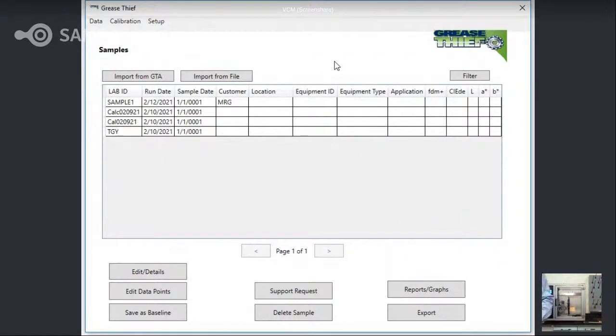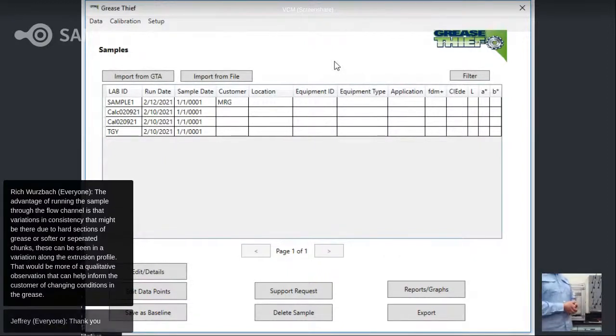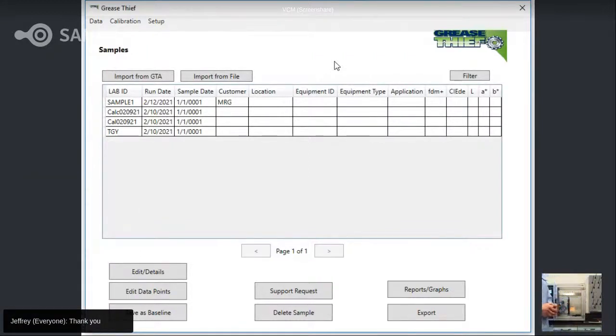All right. I know the other thing we had to talk about, one thing that we'll get out of this, and we mentioned it slightly, is that our die extrusion is measuring the dynamic flow properties or consistency changes that have an influence on the grease's properties when it would be changing, whether it be hardening, softening, leaking oil, what have you. So the die extrusion provides value to be able to quickly get that reading, be able to know you're changing your grease, and then if you need to, you would be able to take maintenance action, whether it be changing lubrication frequency or actually needing to go out and have planned maintenance to fix an issue on equipment.